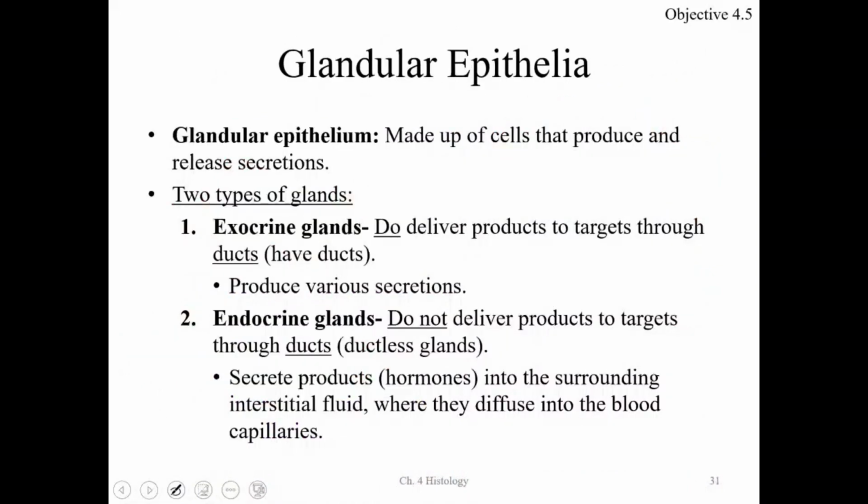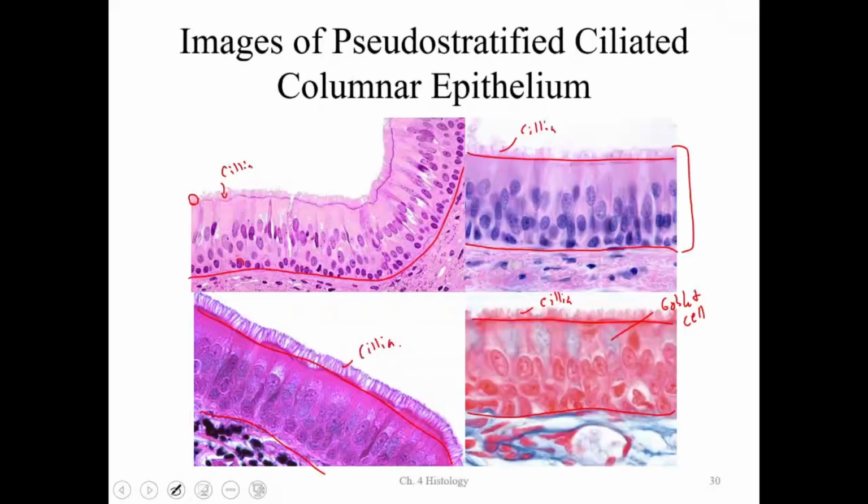Now, really big things that we're going to talk about. Now that you've seen the tissues, it will take students about 8 times going through these various slides and tissues before they really start to get it. The first time you look at it, it looks like a bunch of pink and blue blobs, and you're like, I don't see any of what my professor says.